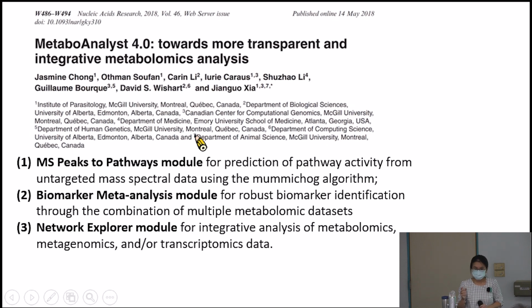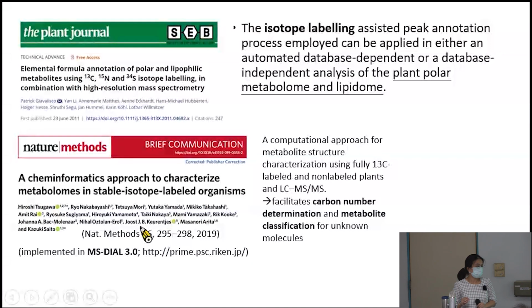But it's not possible to validate all of these compounds. So, for example, in a paper such as this one, they validate probably one or two compounds and found that the validation of their sample is identical with the prediction. So they mentioned that this prediction probably works. Yes.